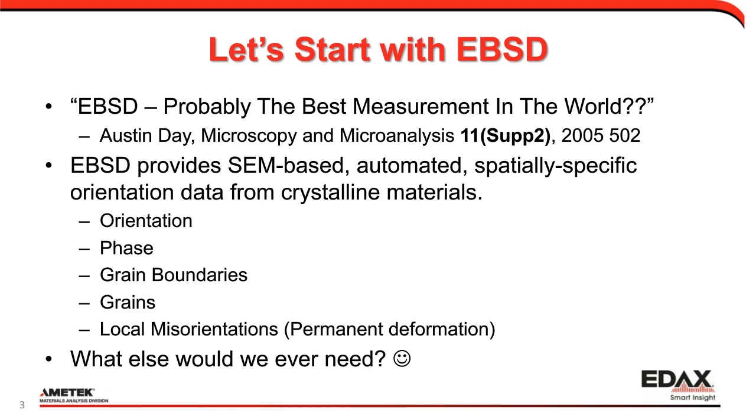What's important about EBSD is it's an SEM-based technique that's automated, provides spatially specific orientation data, but also provides information about phase, grain boundaries, grains, and local misorientations. So you look at that and you say, what else would we ever need? That's a pretty full suite of data.